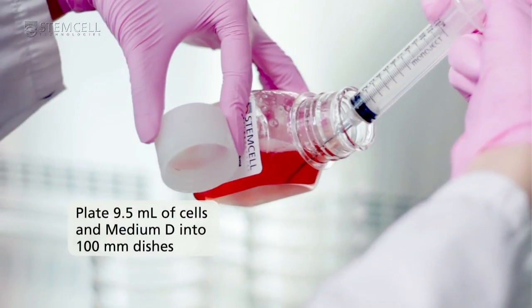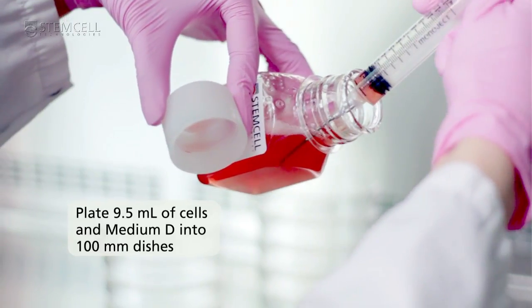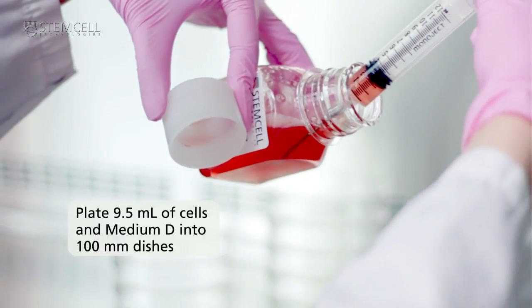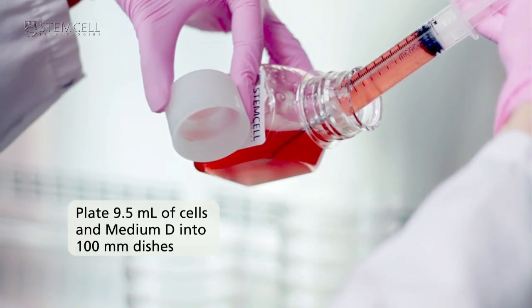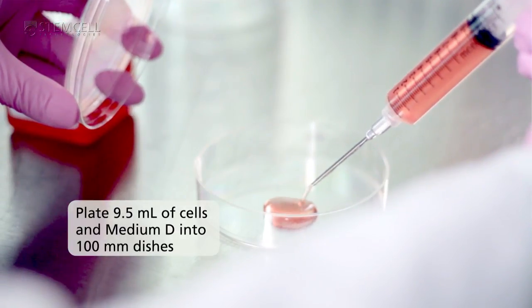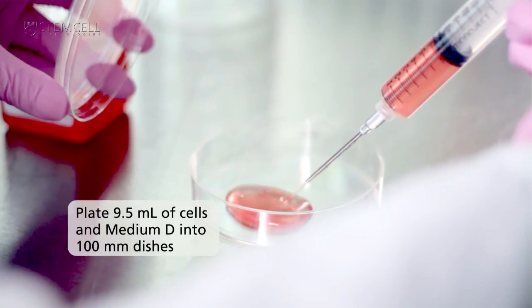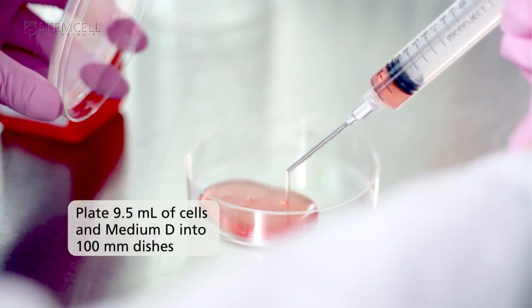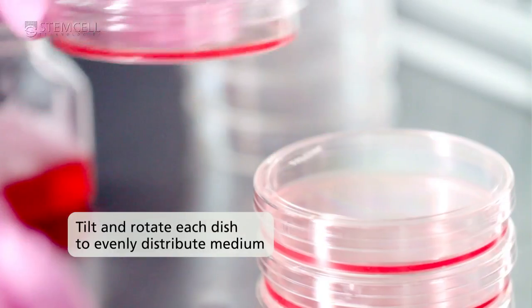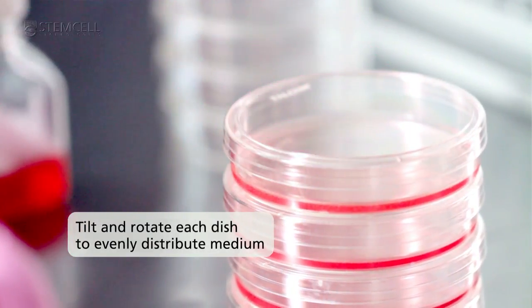Aseptically plate 9.5 mils of cells and medium D into 100 millimetre dishes. We recommend the use of a syringe and blunt end needle. Do not use a serological pipette to avoid medium and cell loss due to sticking of the viscous medium to the inside of the pipette. Tilt and rotate each dish to ensure that medium is evenly distributed.